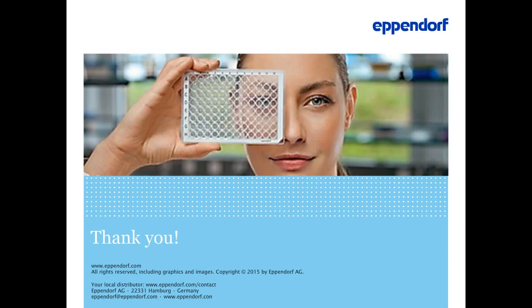How do leachables affect? As I said, it's a very complex process. It's a diffusion, there are some chemical reactions taking place, but in the end, there are different classes of substances going in at different temperatures and times into the sample. So the key message here is, if you avoid consumables with critical additives, you're on the safe side.